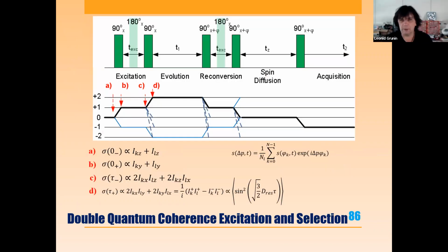Okay, let's go on. The pulse sequences. I try to be again maximally simple. You need to excite so-called double quantum transitions. To generate any multiple quantum transitions, you must have so-called transverse relaxation active. To make it active, the best way is to apply a 90-degree pulse. You apply a 90-degree pulse, and then while your magnetization in the transverse plane still exists, you apply another one. And that one is generating all possible transitions in the spin system. As I mentioned before, in a two-spin system, it can be maximally transitions with the order of +2 or -2. Then these are generated.